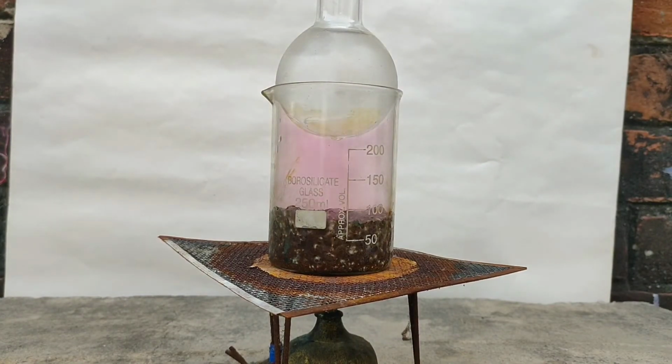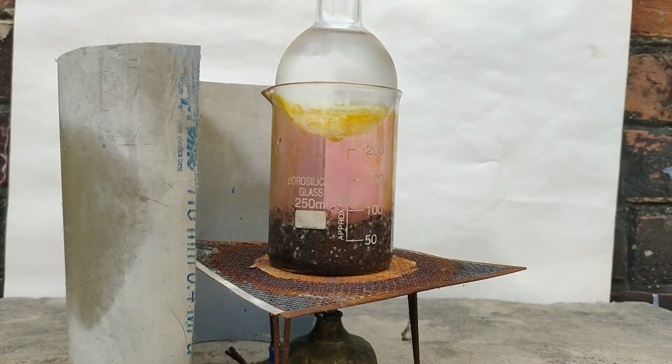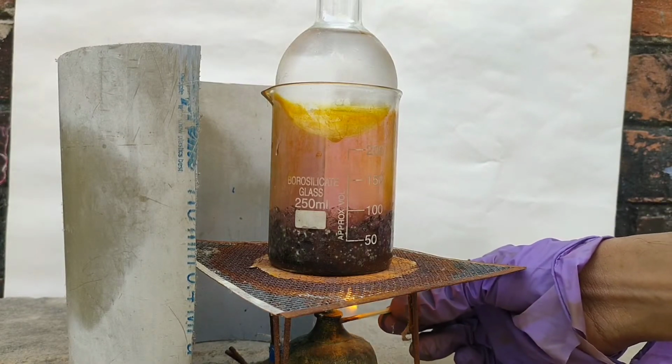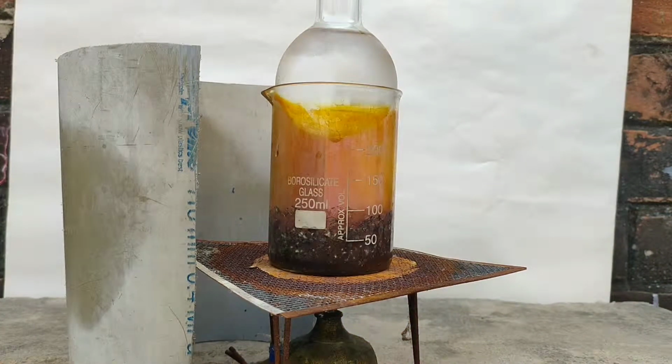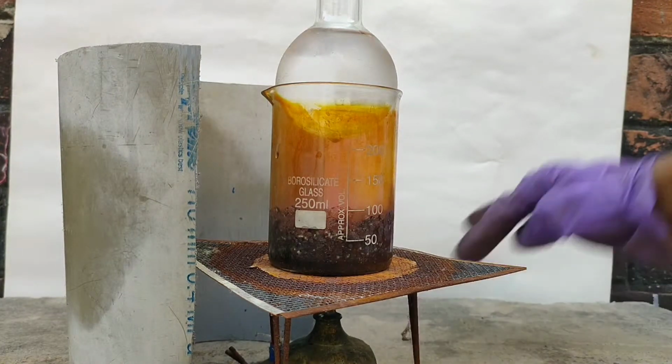I placed a round bottom flask filled with ice cold water to condense the iodine. I placed a windshield because I was doing this outside and there were a lot of air currents. Now I lit my spirit lamp and started heating. As I heated it, more iodine was evolved.